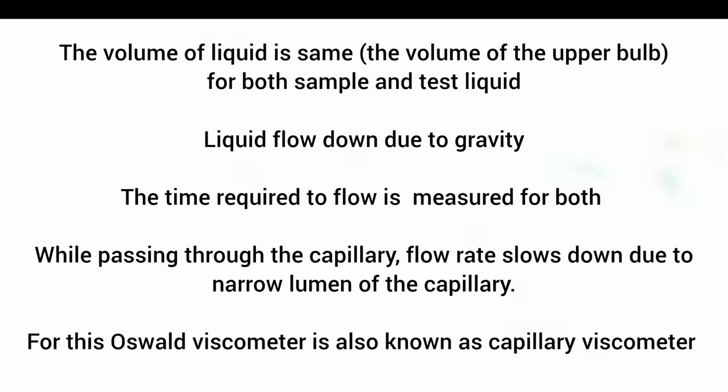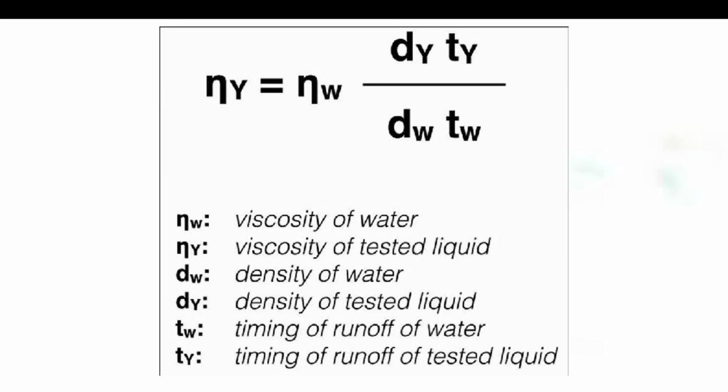The time of flow for both is determined by the viscometer. The equation shows the relationship of viscosity with density and time of flow.